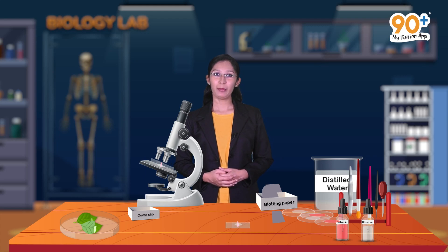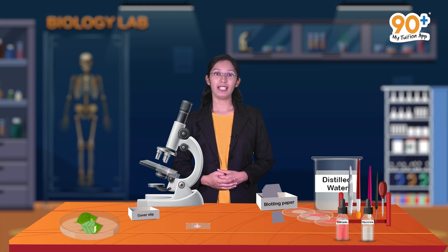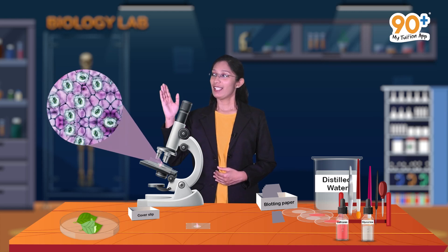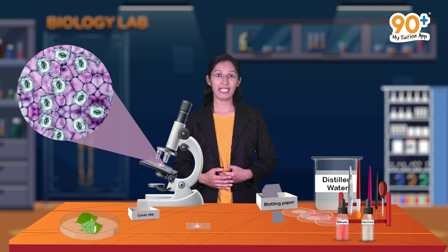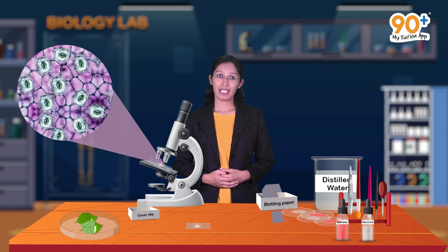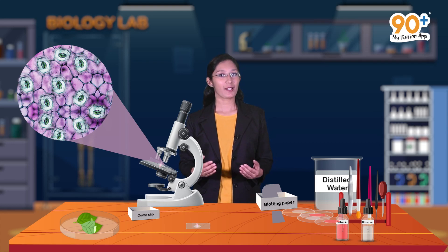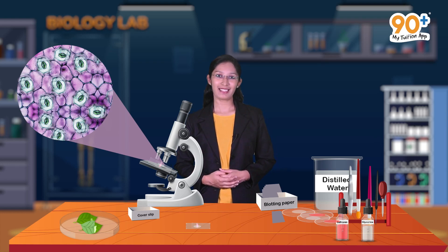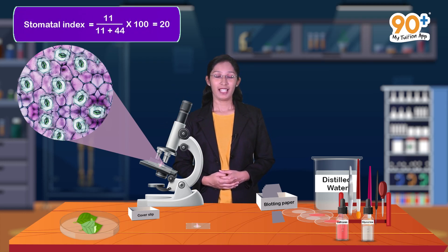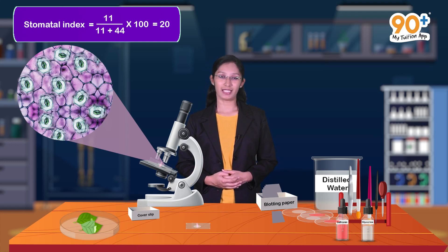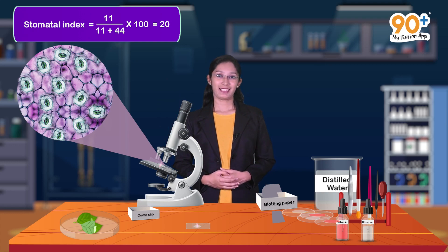In the same way, we observe the lower epidermal peel under the microscope. Here the stomata and epidermal cells can also be seen very clearly. The total number of stomata is 11 and the total number of epidermal cells is 44. Using the equation: stomatal index = 11 / (11 + 44) × 100 = 20.